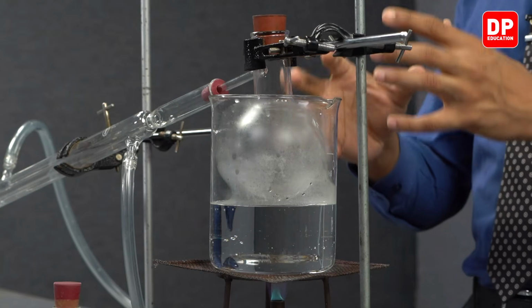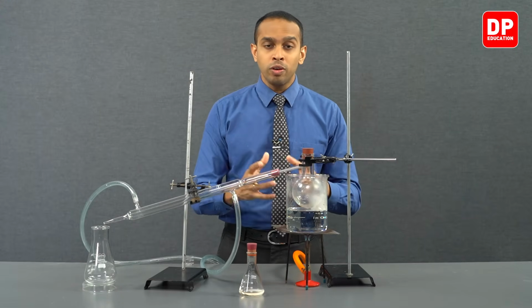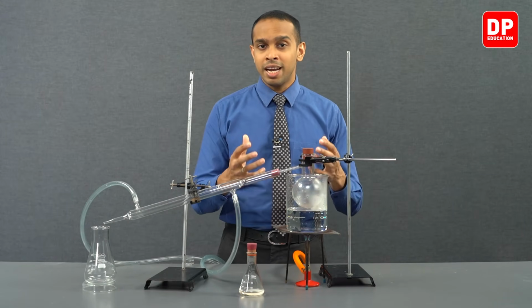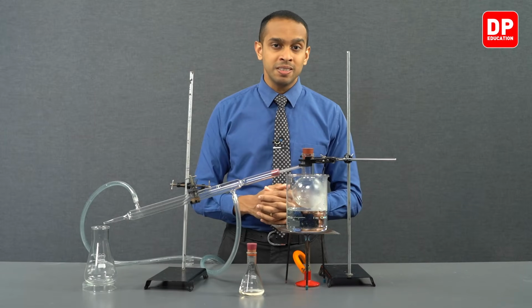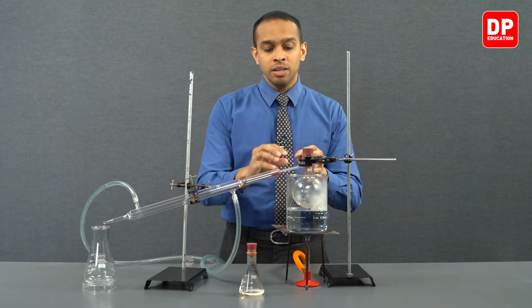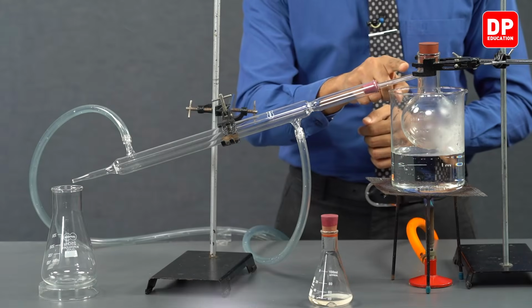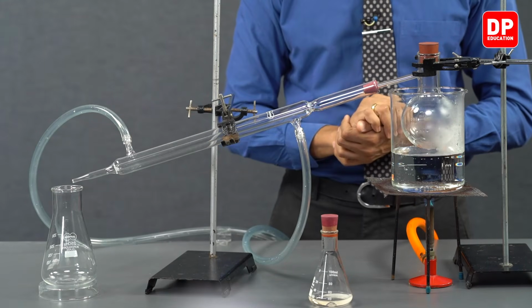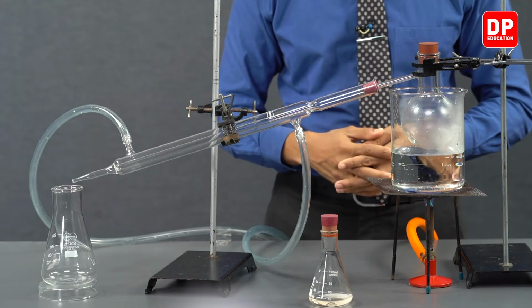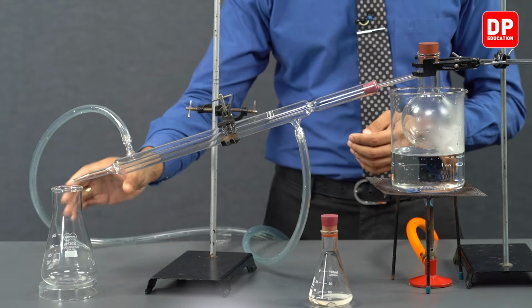So when we are carrying out this simple distillation, the component with a lower boiling point will boil first. In this case, diethyl ether will boil first and will turn into a gas, and it will be removed from the mixture as a gas. So it will turn into a gas and it will be directed onto this Liebig condenser, and in the Liebig condenser it will cool down to produce a liquid, and it will be collected in this Erlenmeyer flask.